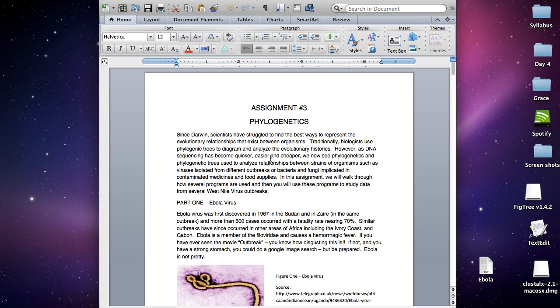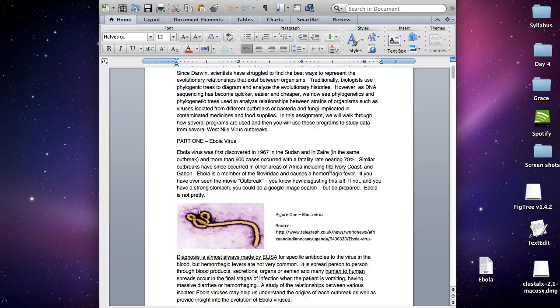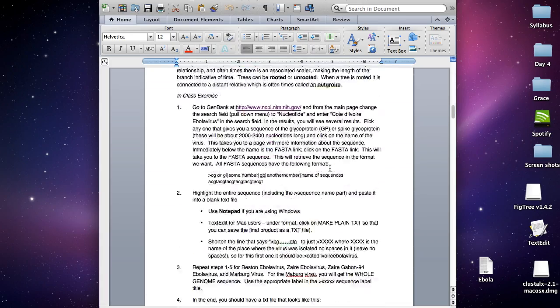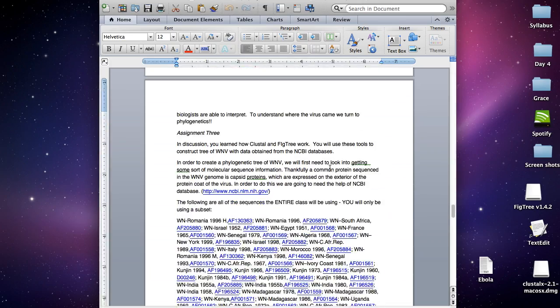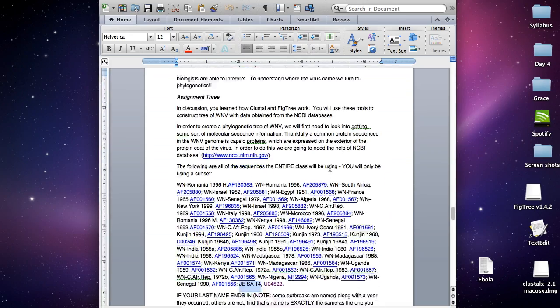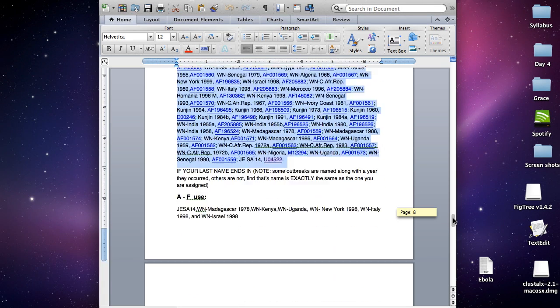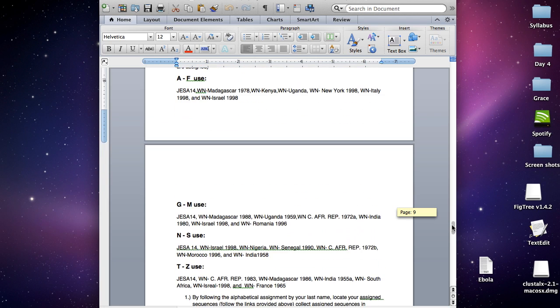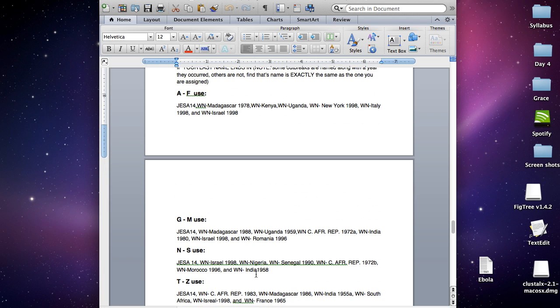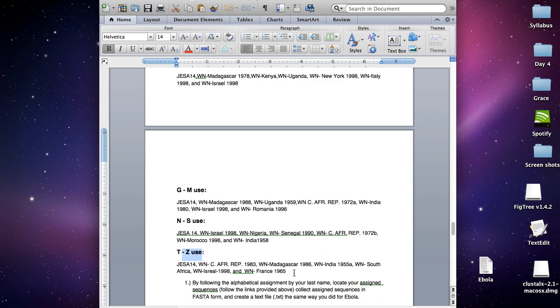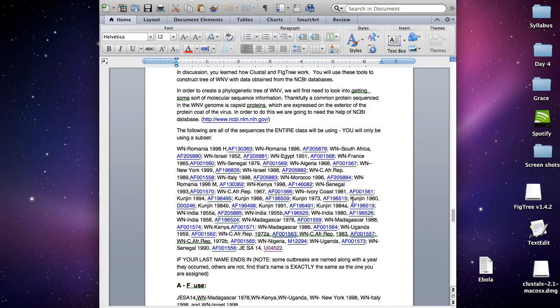First, you need to obtain your sequences that we'll be looking at. You can do this by scrolling all the way down to part three of your assignment, and here are all the sequences that we'll be looking at. The sequences are divided into groups based on your last name. For example, my last name starts with Z, so the only sequences I'm going to be looking at are listed here. When you're looking for your sequences in this giant block of text, make sure the name and the date, if there is a date, match so you're using the correct one.